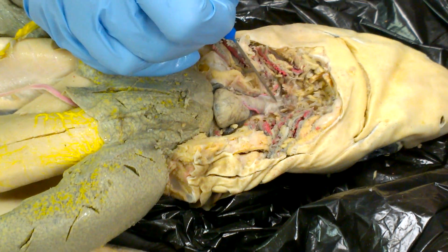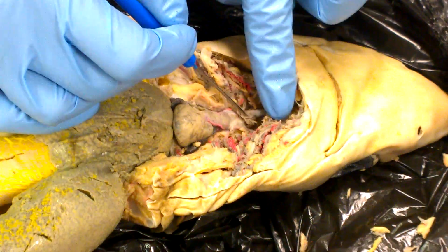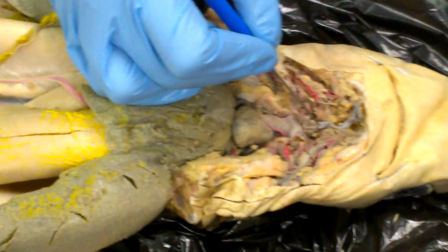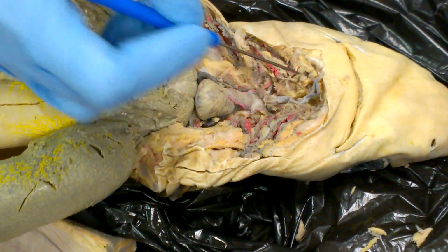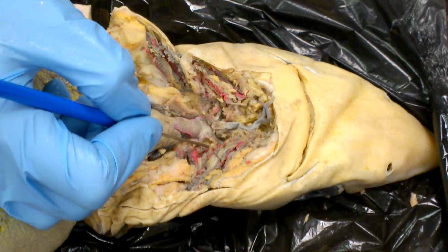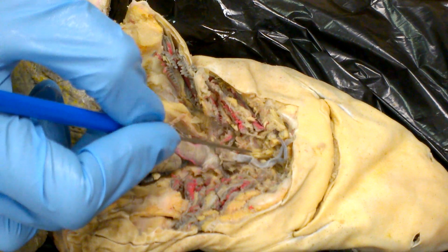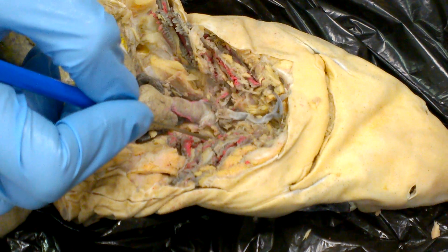And then from that, you can start to see it right here. I believe that goes up, that little piece that's missing. Okay, so from the conus arteriosus, into the ventral aorta. I can't remember that one. Ventral aorta. Does that include the branches? No, it's just the up part, not the branch. Because the branches have their own name. They are carrying blood into the gills, so they are the afferent branchial artery. Yes, except it's branchial, B-R-A-N. It's weird. You think it should be an O, but it's an A. Okay, so we've got the conus arteriosus, and then the part that goes up, which is the ventral aorta. Perfect, and then the branches, the afferent branchial arteries. Excellent.